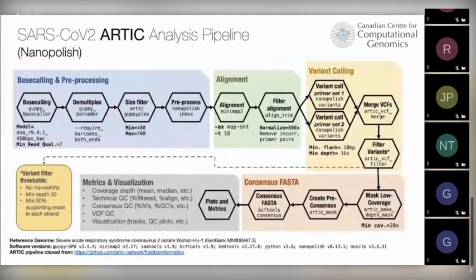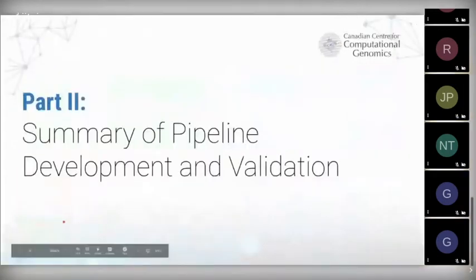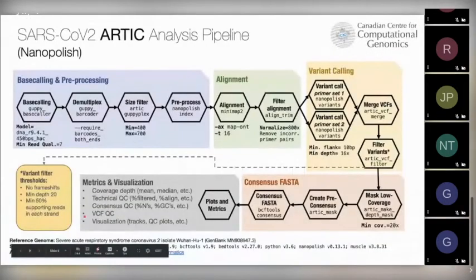The other pipeline that we have is the one that we use for long reads, which in our case right now is only Nanopore. This pipeline is very similar. It's actually not yet fully implemented in our GenPipes framework because it's almost exactly what is being run by the ARTIC network. So I'm going to very quickly go over how it works, but in principle it's very similar to what I just described, except mostly with a different order.